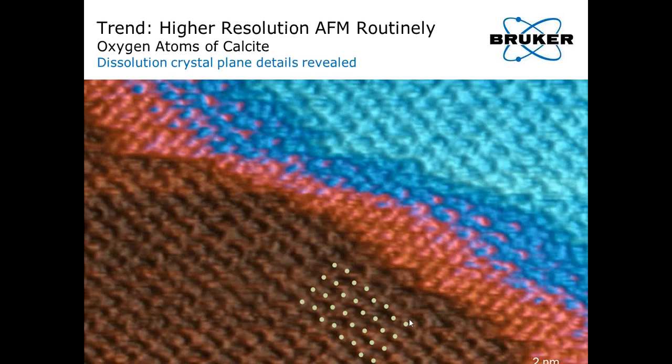But here we want to show you, with the PeakForce Tapping mode, an image on calcite in liquid. So when the crystal dissolves, you can see the atomic structure on different planes of the lattice. And also here is the model to show you where the oxygen atoms are.